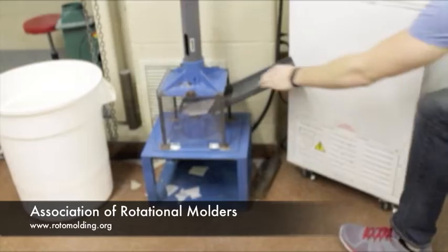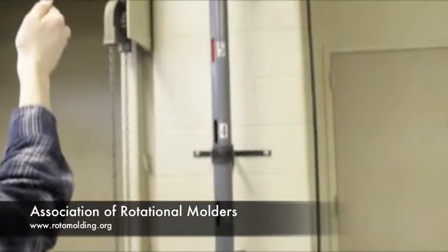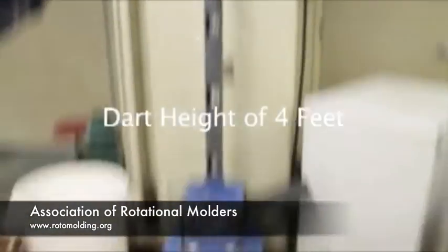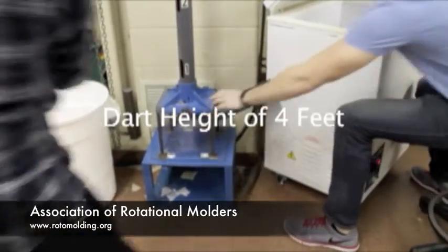The falling dart, in this case is procedure A using a 10 pound dart, impacts the surface of the part that will be in contact to the mold when molding.